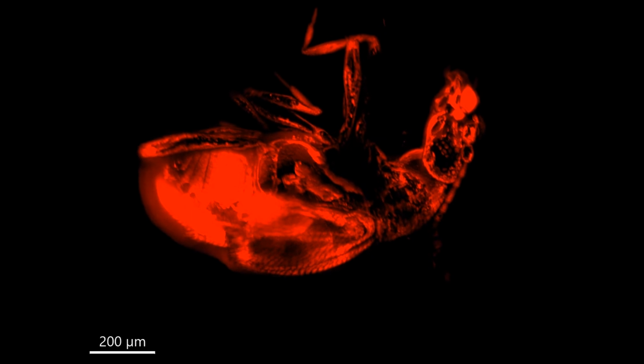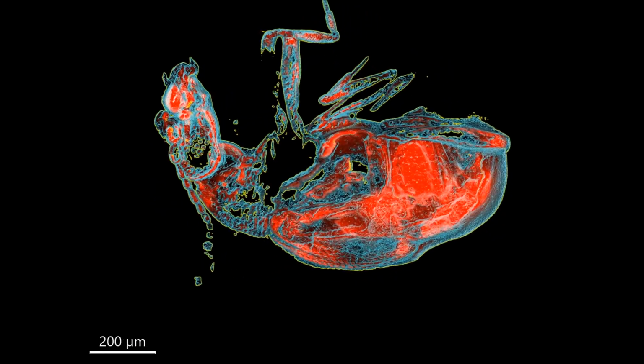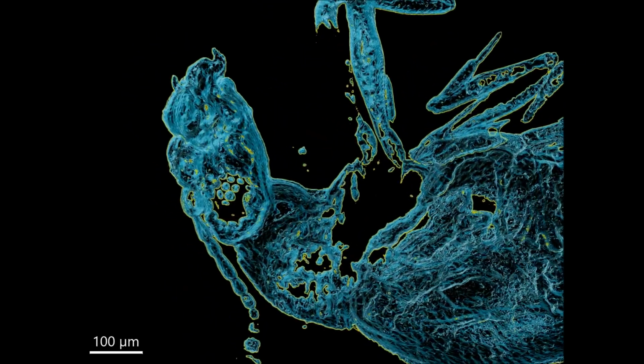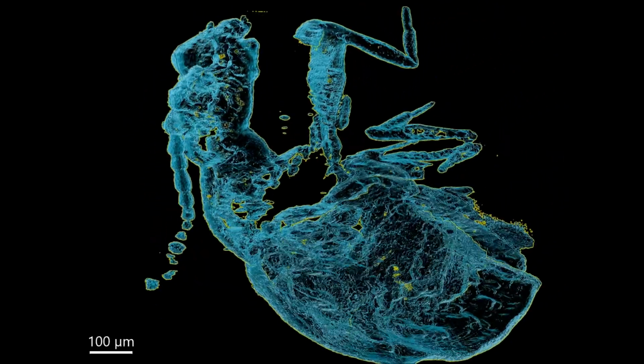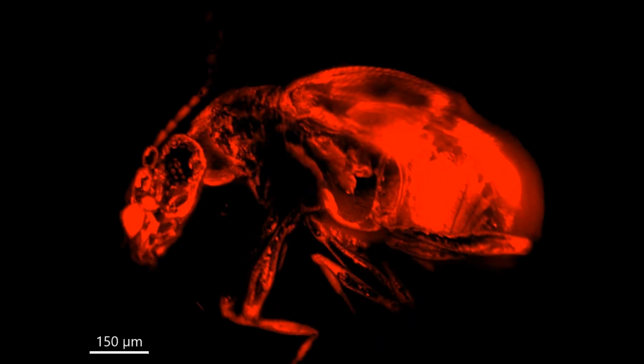However, the limitation is that light does not penetrate well through the layer of carbon, which is the only thing left from the ancient insects trapped in amber for a long time. As a result, we can only reconstruct half of the animal, but it provides a very detailed, colorful image, and you can always flip the specimen over to image another side.